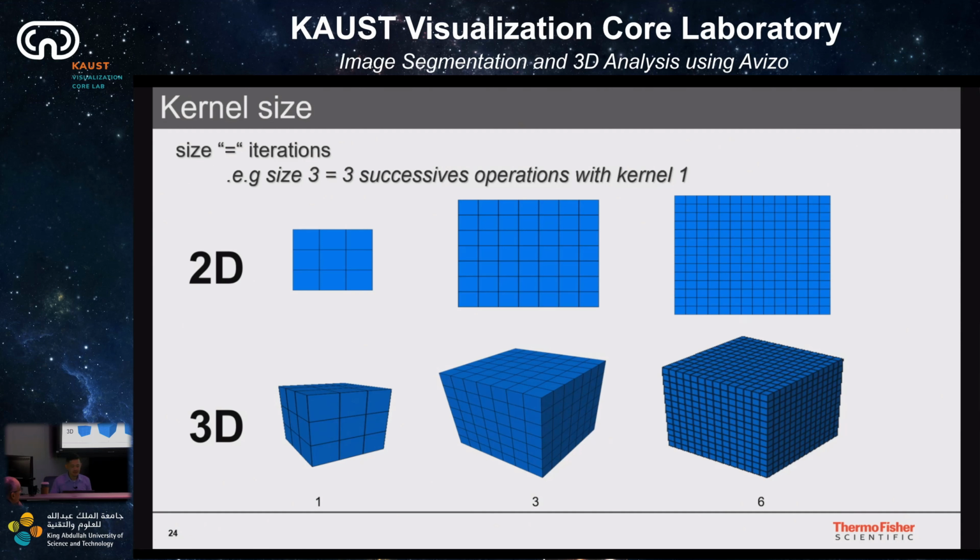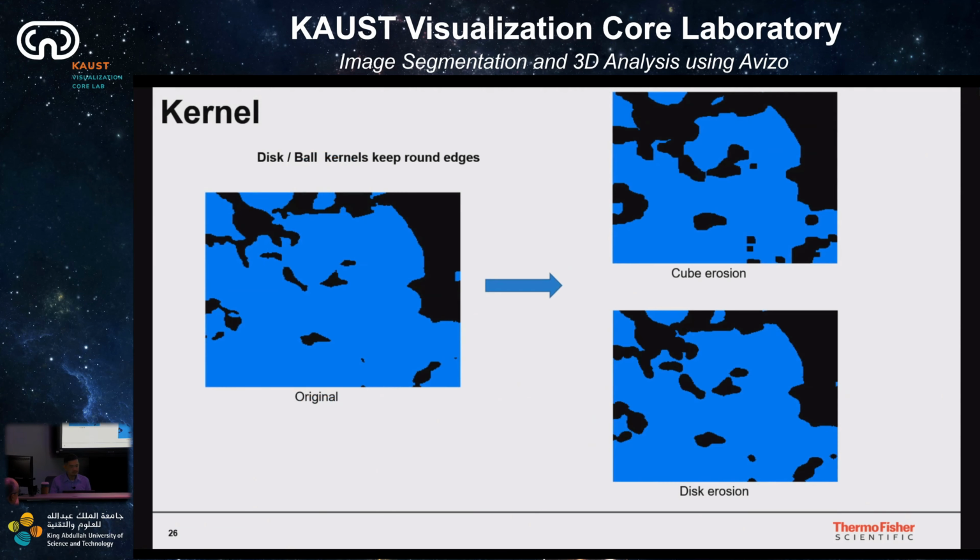But in 3D, you actually have 3 options. You have only the cube of the voxel that are face to face, so you have a total of 6, and then 18 and 26, the maximum number of neighboring voxels whose intensity values you can use to calculate the average of the data. And then some other operations.